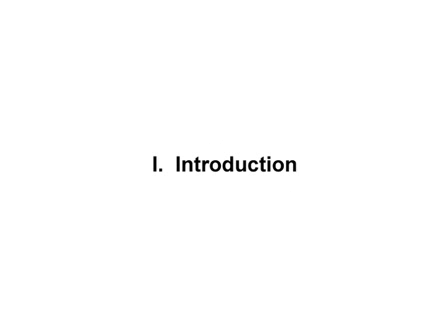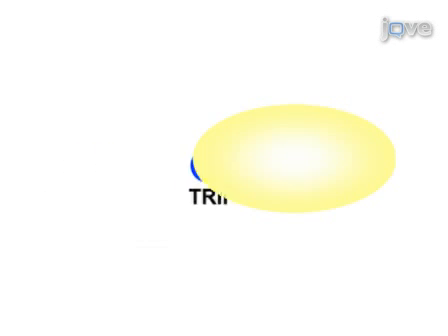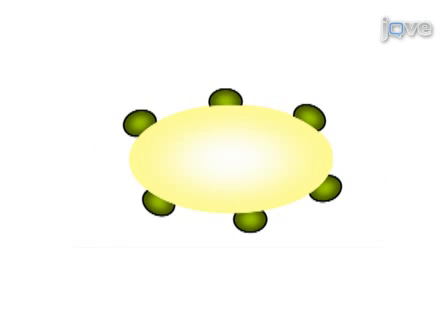In the Transkingdom RNA interference or RNAi procedure, bacteria are used to deliver short hairpin RNAs or shRNAs targeted against the gene of interest, MDR1 in this protocol, into cancer cells with the aim of silencing the gene of interest by RNAi. First, Escherichia coli bacteria are transformed with an shRNA expressing vector.